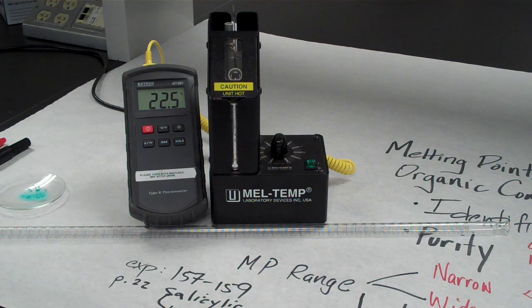So I hope you'll enjoy today's experiment, and there is a lab report sheet that you'll complete and answer a variety of questions, which are all addressed in the introductory materials of the laboratory description in your manual, as well as things I've commented on throughout the video today.